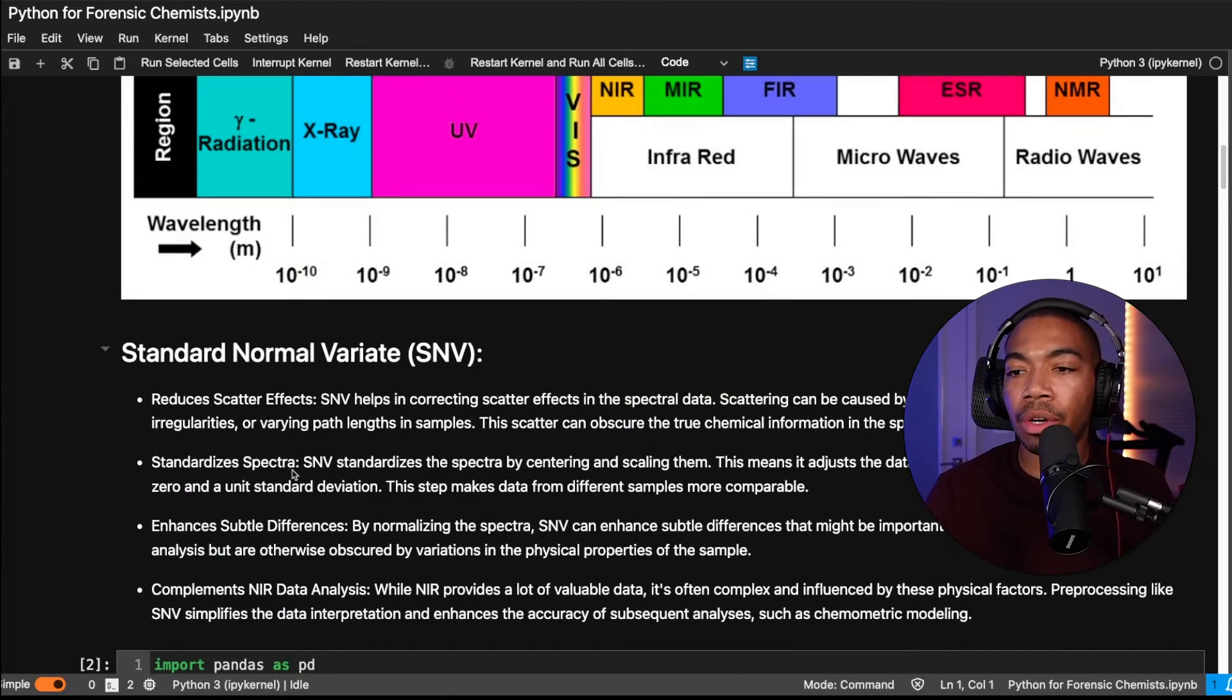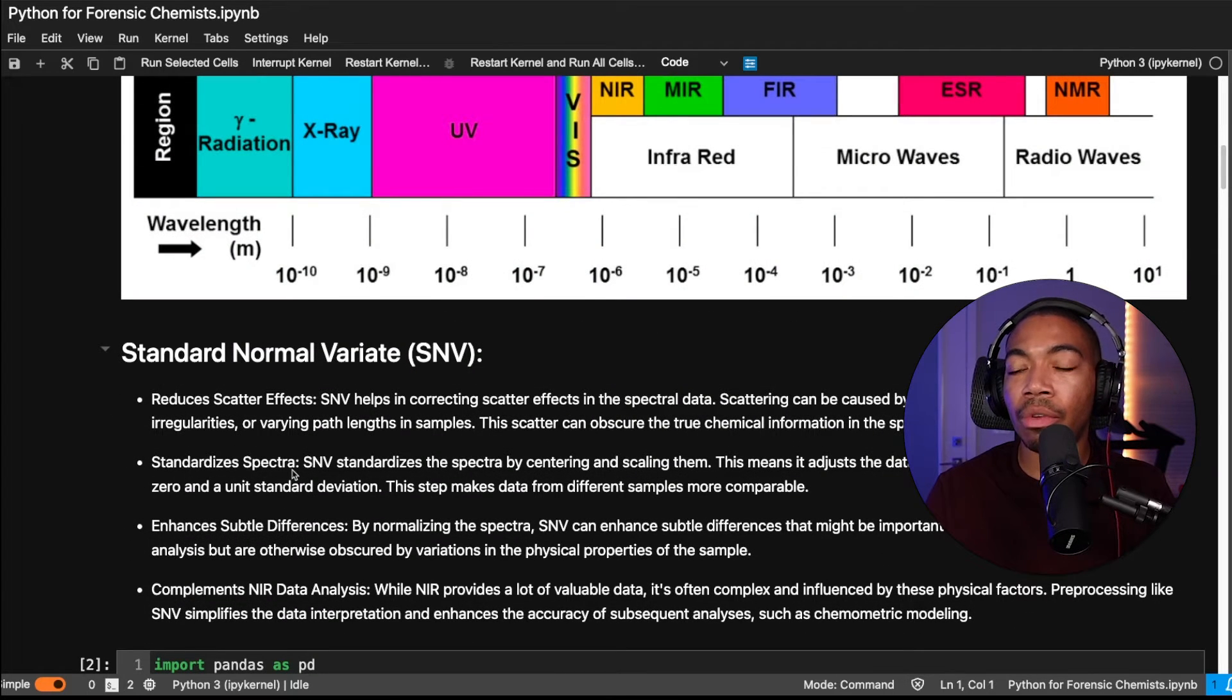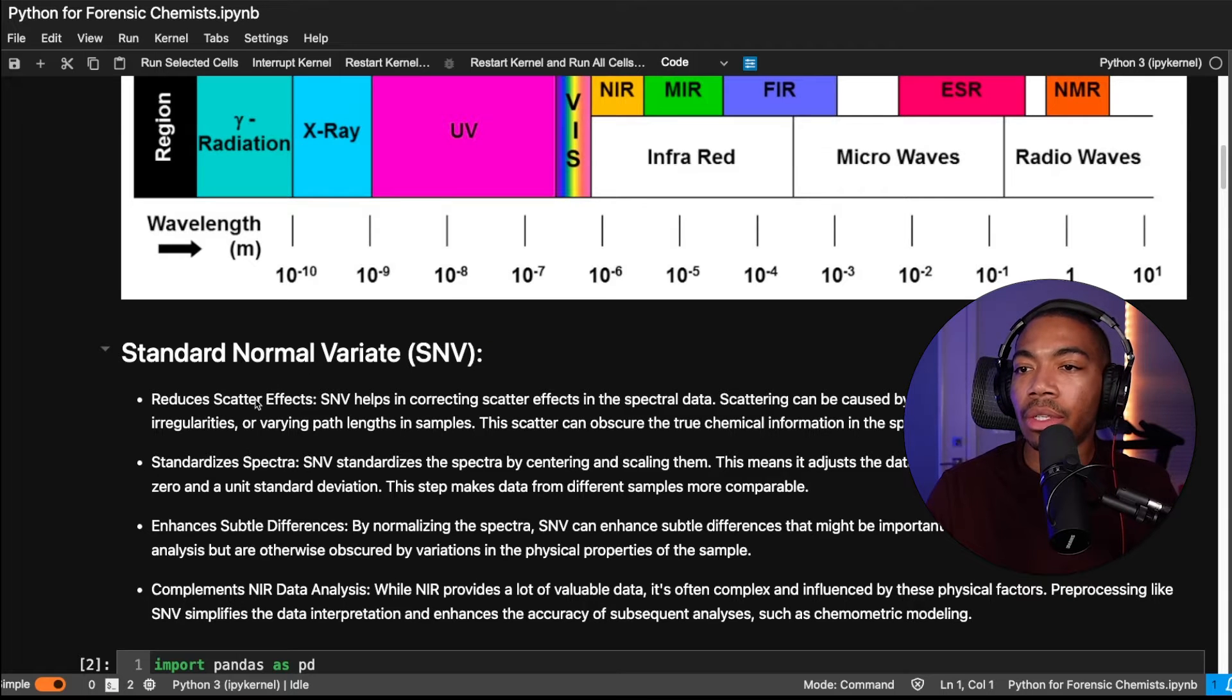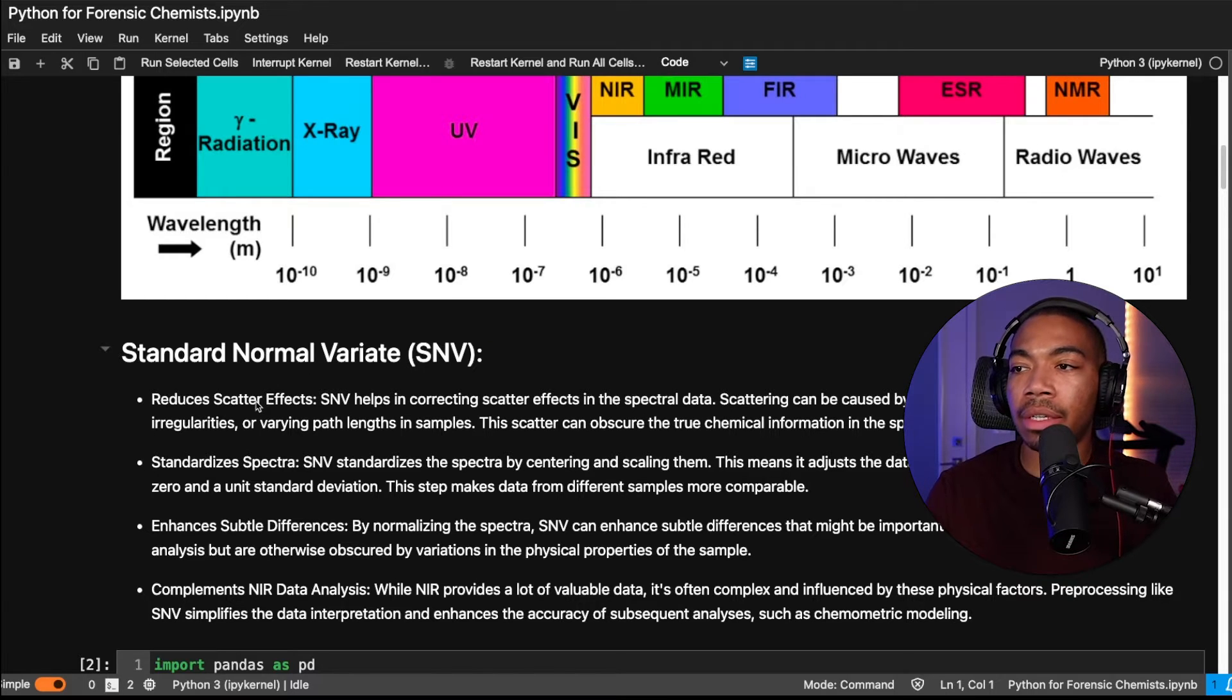And now in this video, we're going to focus on the standard normal variate, so this SNV idea. And so the goal is to reduce the effects of scatter.